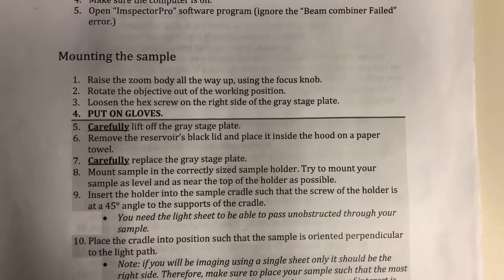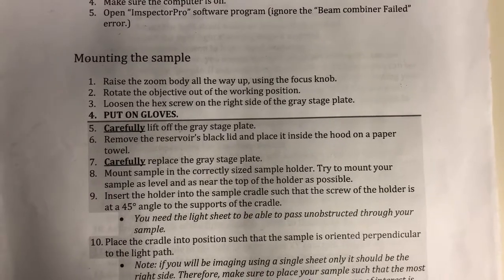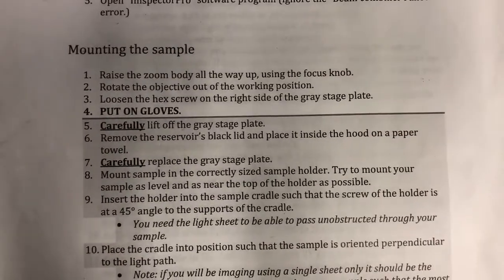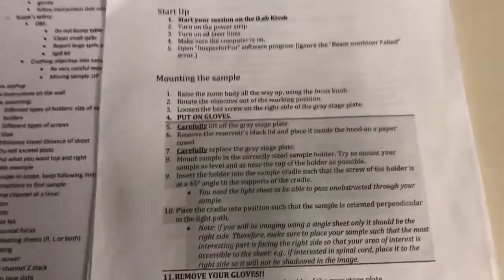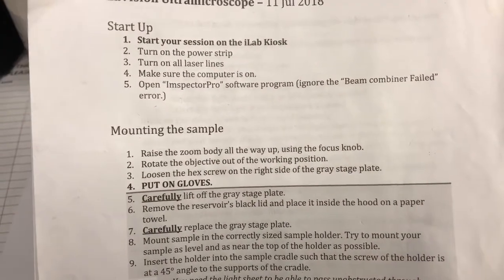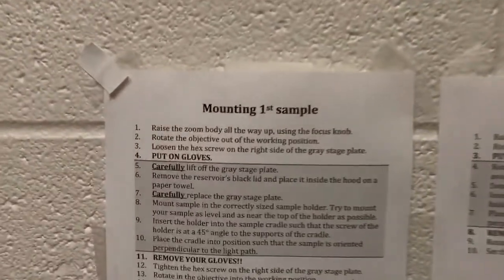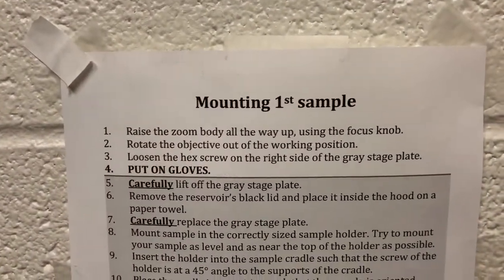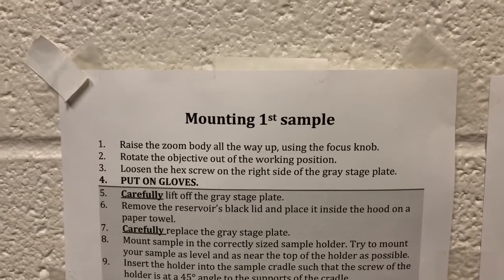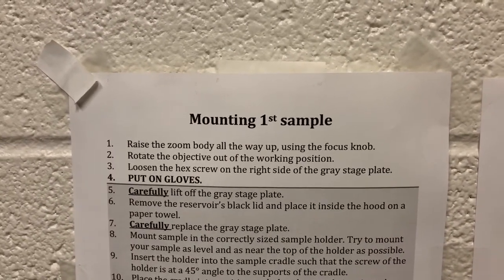Now we're going to describe how to mount the sample. The first three steps are done before putting on gloves, so we need to do them by hand. We've made a big version of these instructions in a large font, so if you're in the room you'll be able to see it very clearly. You can stand next to the microscope and have both hands available.